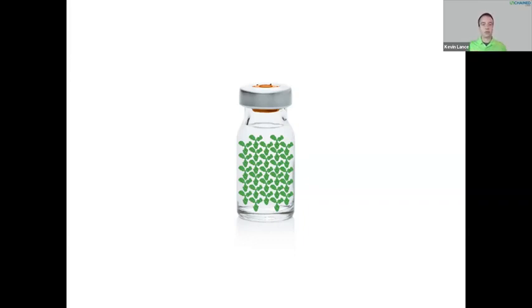If you're working on formulation development, then viscosity can also be a measure to help screen for the best performers. And even if you're working on process development, then viscosity is a critical quality attribute to know before you go into any filtration steps like TFF or sterile filtration, or into your fill-finish process, to make sure that you're going to get the results that you want.